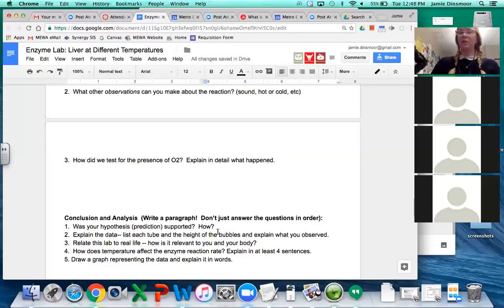Okay. Notice though, the reaction is still just going, producing tons of bubbles here. The liver is just happily reacting away. And then we're almost done with this. It's just the fire part's fun. It's fun. Not gonna lie.